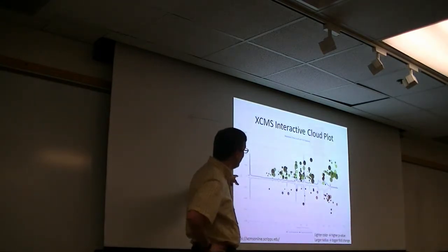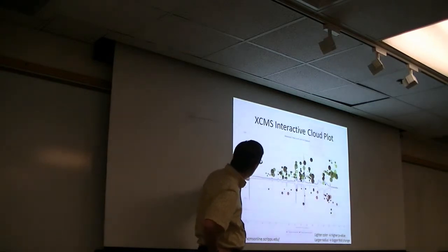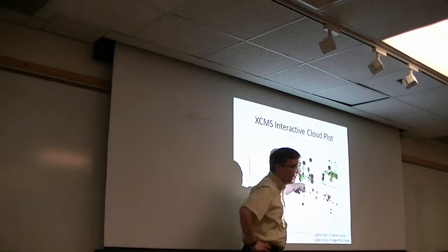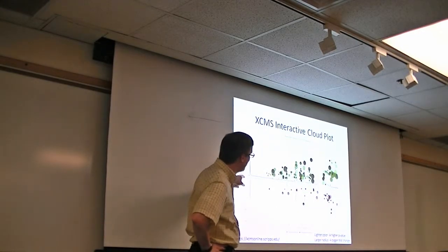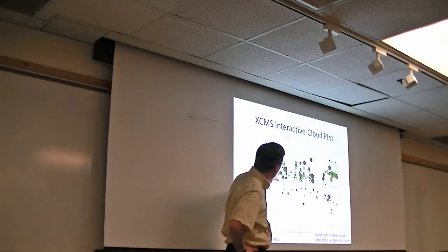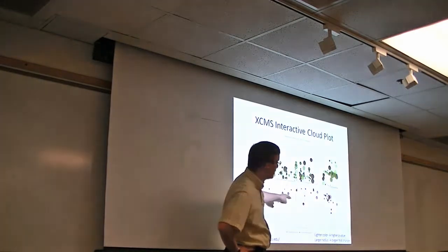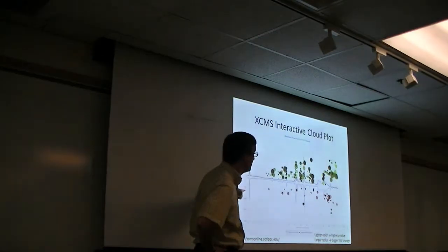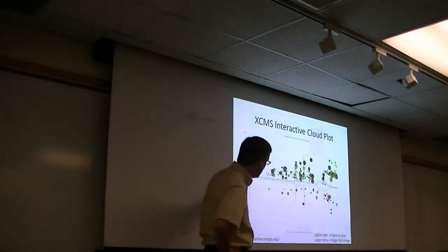So we start with a total ion chromatogram. So we're looking at how much intensity is seen as a function of time across here. And then we're also looking at m/z values. So these m/z values are represented by where vertically these dots are drawn. So one that's drawn here was observed in negative polarity around negative 600.